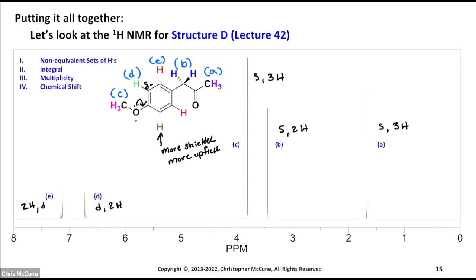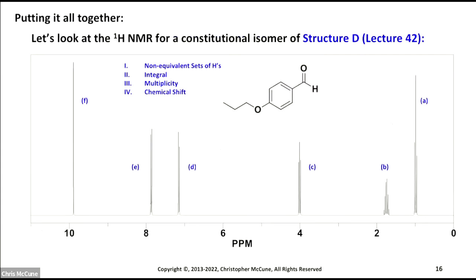We've analyzed its chemical shifts, we looked at its splitting, we looked at the number of unique signals, and now we tie that into chemical shift, and we can assign the right protons to each peak. If you need to use chemical shift tables, they're there to guide you. They're not always going to show the exact chemical shifts because they're generic tables. Here's the constitutional isomer. So let's do the same thing here. If you want to try this on your own, now is a good time to pause your video and do so. Otherwise, I'm going to continue to talk my way through this.